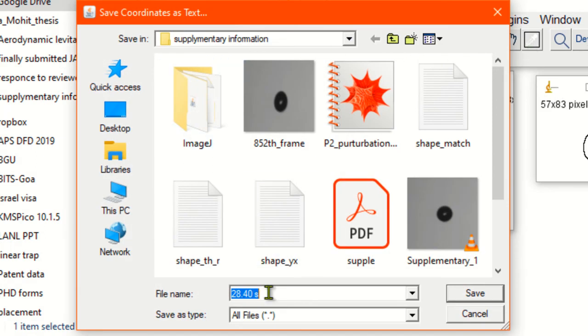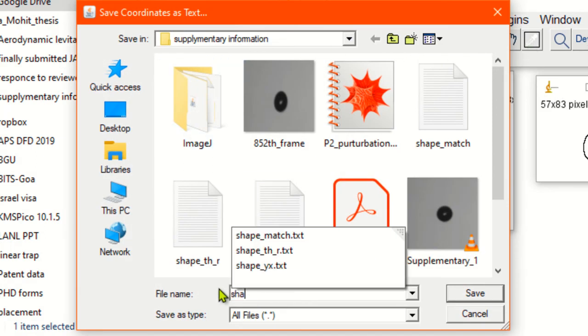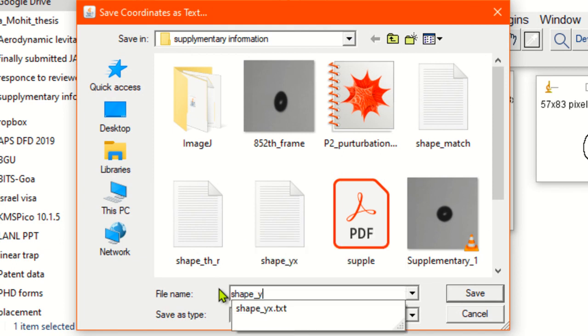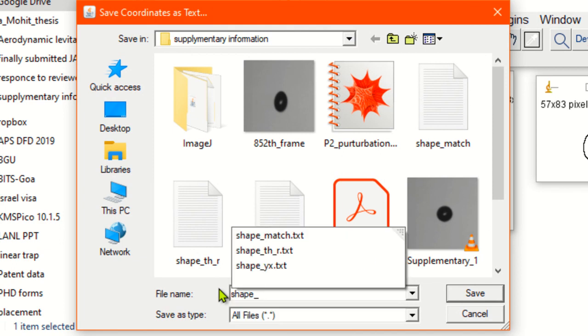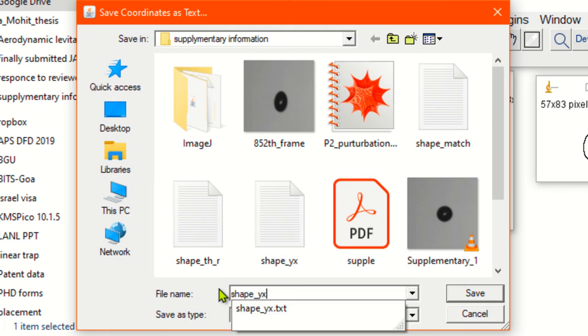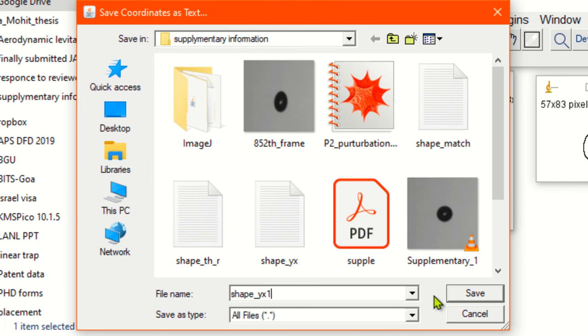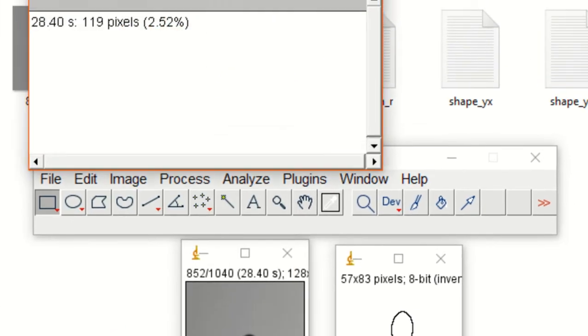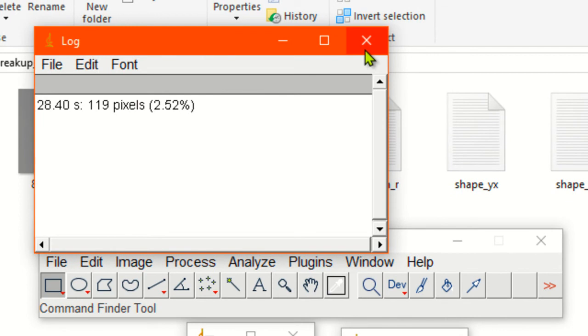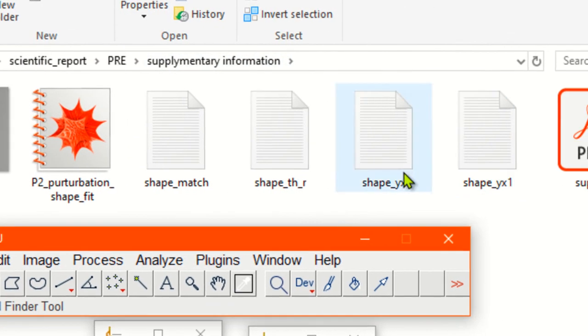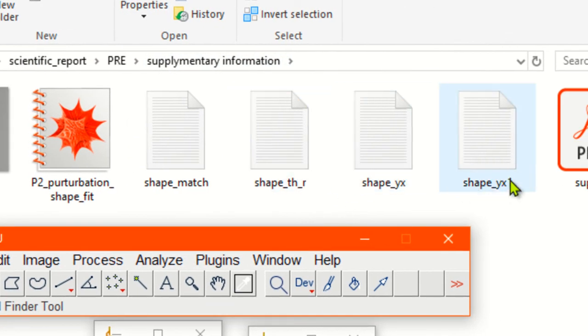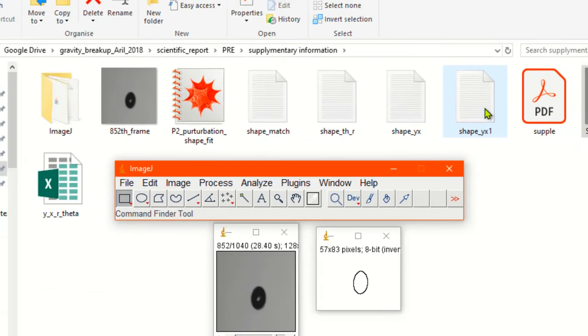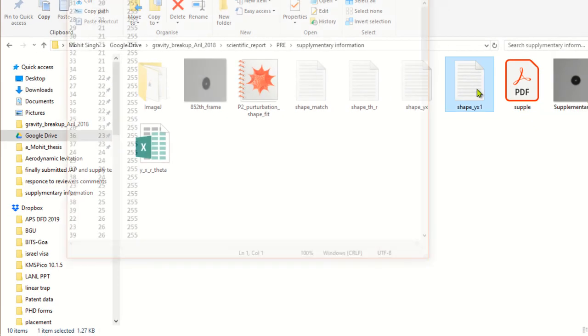Now you can just rename it. Shape YX data, all right. Suppose we will save it like this. We'll click save. You can see the file shape YX.